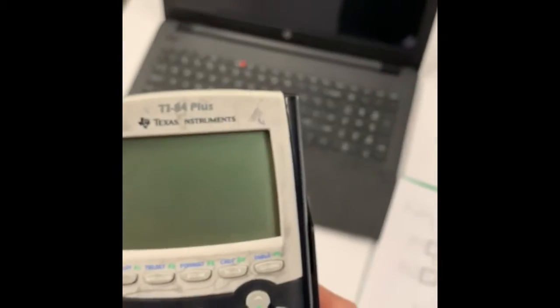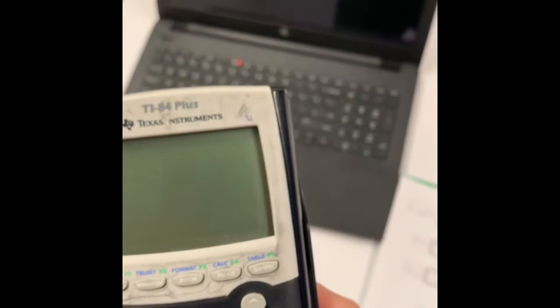Then, at the end, after the zinc was added, the new mass was 49.86 grams. Putting this in my calculator, there's an error right there.